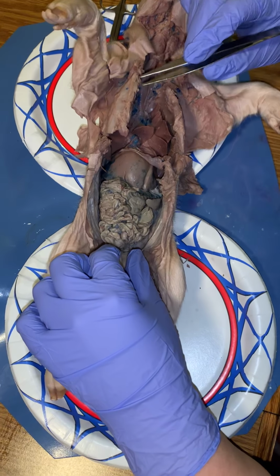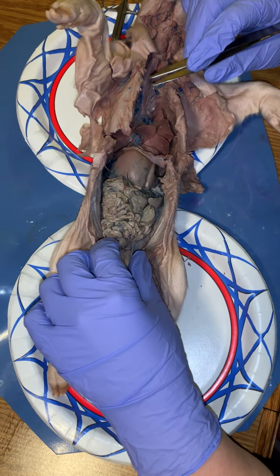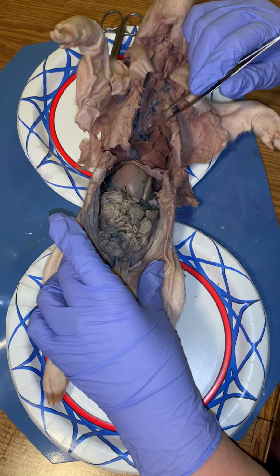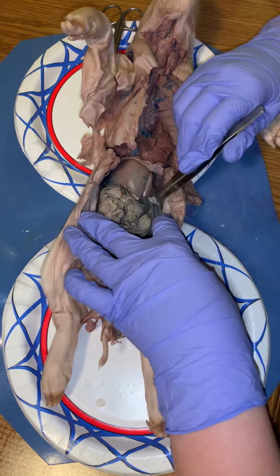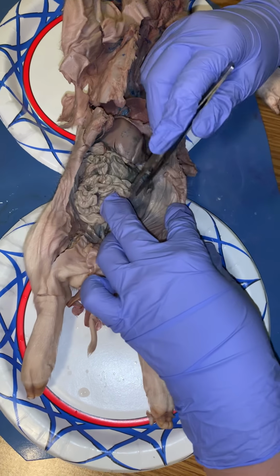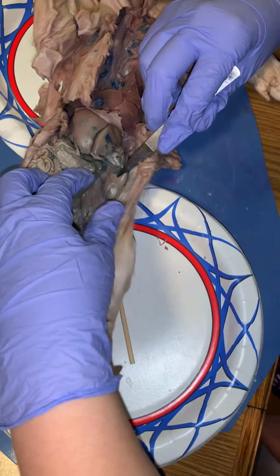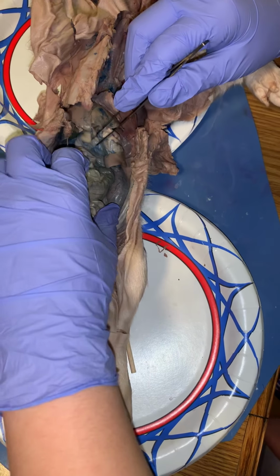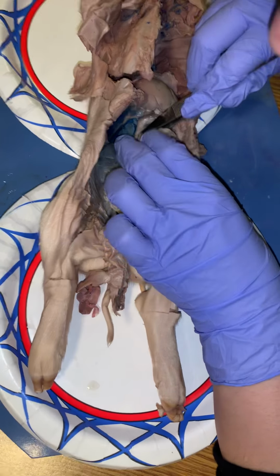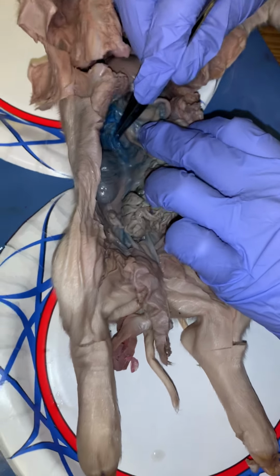Okay, and then the superior mesenteric artery and the inferior mesenteric artery hook onto the intestines and rectum, and it says that they could be difficult to find. So whenever I did some moving around with the organs here, I could find that one of them is connected right about here, if you can see that, and then the other is right here. If you can kind of see that big blue area, that's where our mesenteric arteries are.